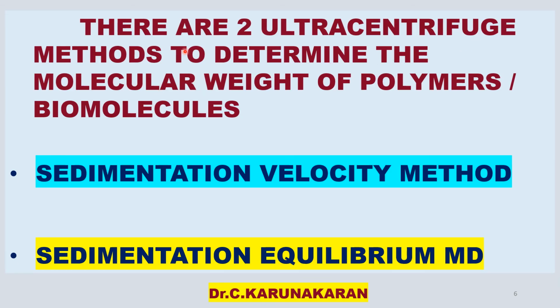Using the ultracentrifuge method, it is possible to determine the molecular weight of macromolecules or polymers. There are two ultracentrifuge methods to determine the molecular weight of polymers. They are the sedimentation velocity method and the sedimentation equilibrium method.